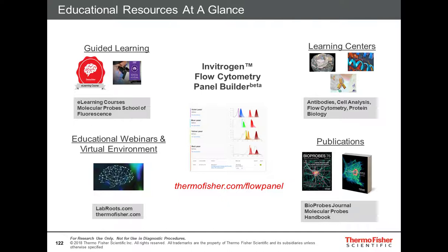Spillover sort of makes you think that there's so much fluorescence it spills over from one channel into the next. And it's really not. It's like I spoke about with FITC, you're really detecting the photons of one fluorochrome in the neighboring detector. So spillover is exactly that. You're detecting the photons of one fluorochrome in an adjacent PMT, or it doesn't even have to be adjacent. You're just detecting the photons of one fluorophore in a detector where you're going to make another measurement.